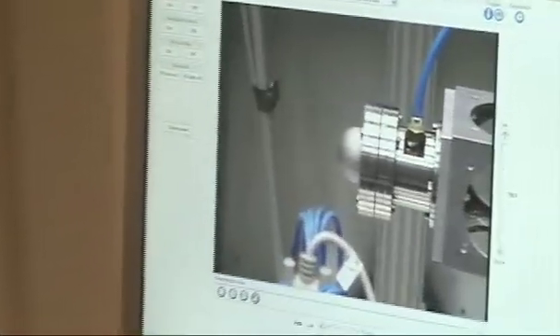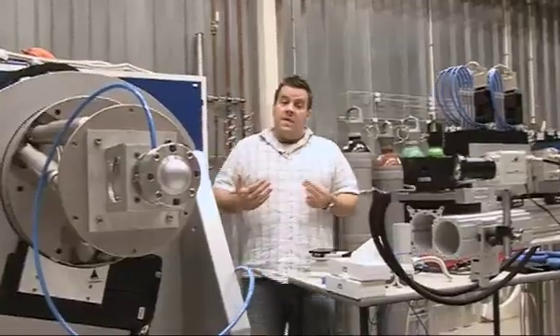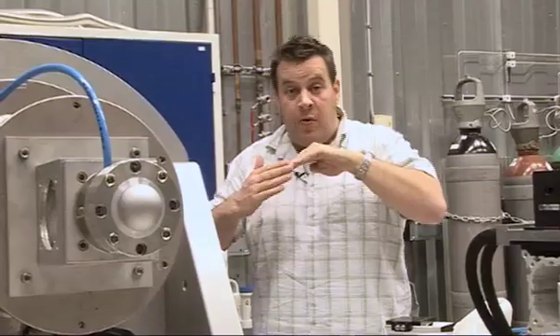It's near the beginning of the periodic table but we rarely come across it. At the moment we're at Max Lab doing some x-ray experiments on a really quite sensitive compound. X-rays themselves are absorbed by everything, so when we shoot them through air, they're absorbed. To measure the x-ray absorption of our compound, which is sensitive to air, we need to remove the air and encase it. So we use beryllium to make a magic box around our sample that the x-rays can enter, interact with our sample, and then exit without interacting with the material around them.